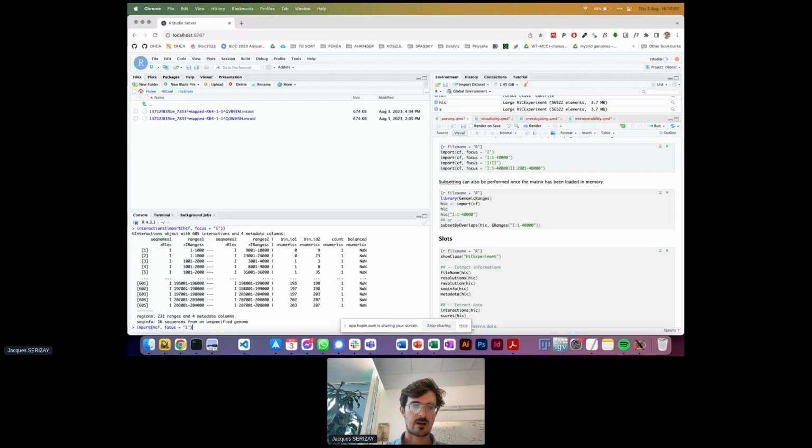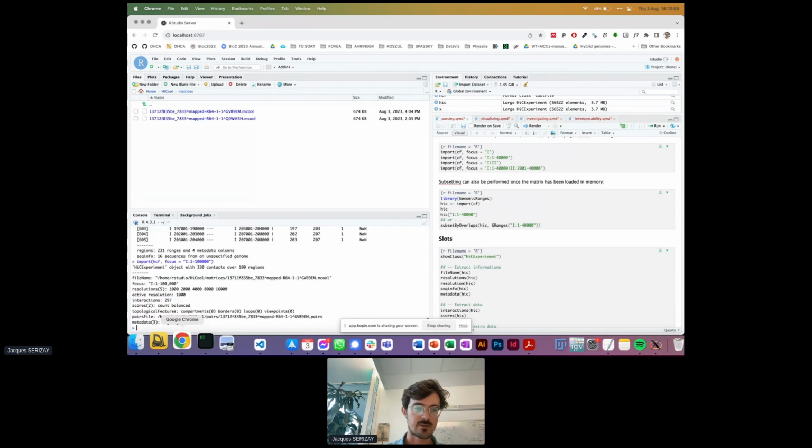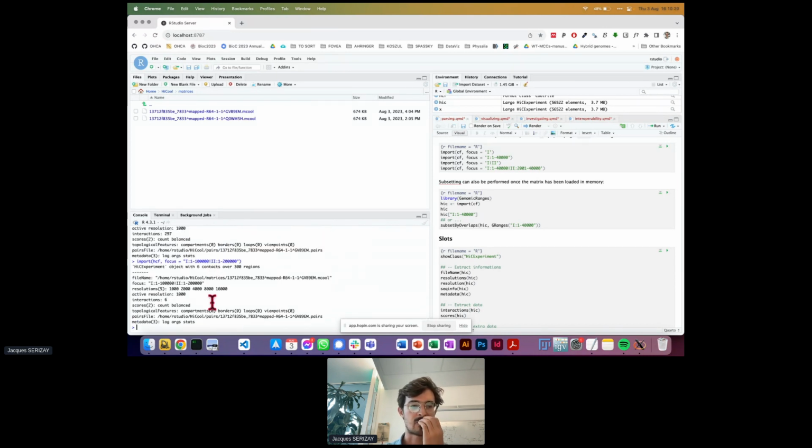Okay, there are alternative ways of importing the data. One can specify a full chromosome or only a part of a chromosome. If I want the first 100 kbs, I can do this. If I want interaction between two chromosomes, that's also doable. Interactions between chromosome 1, first 100 kbs, and chromosome 2, first 200 kbs. This can be done using this approach.